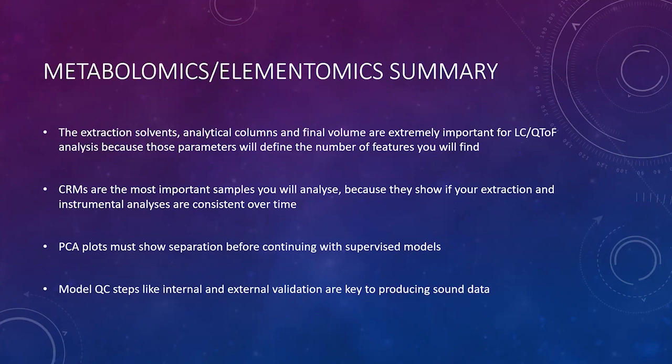CRMs are the most important samples you analyze because they show if your extraction and instrumental analyses are consistent. PCA plots must show separation before continuing with supervised models. And these model QC steps like internal and external validation are key to producing sound data.